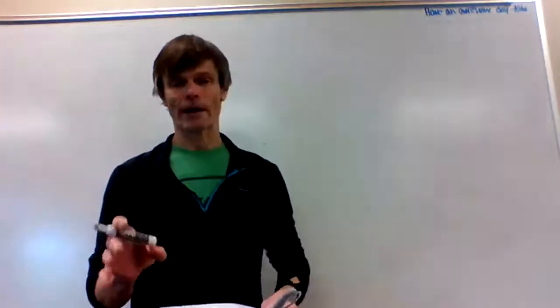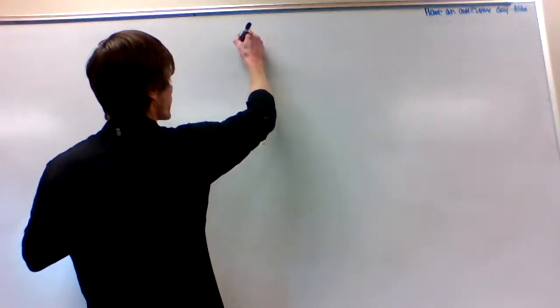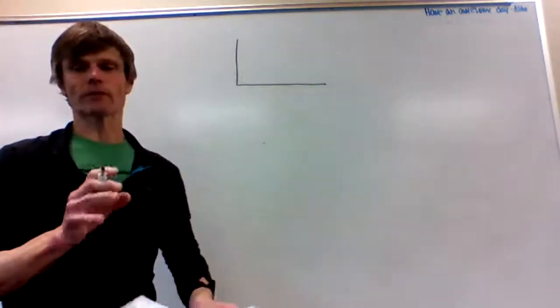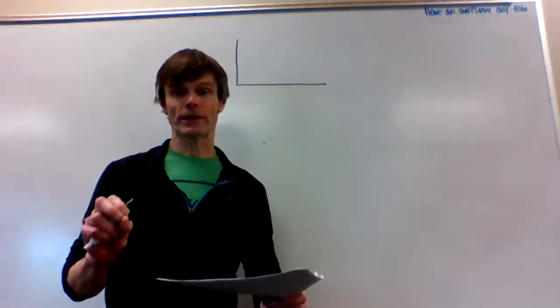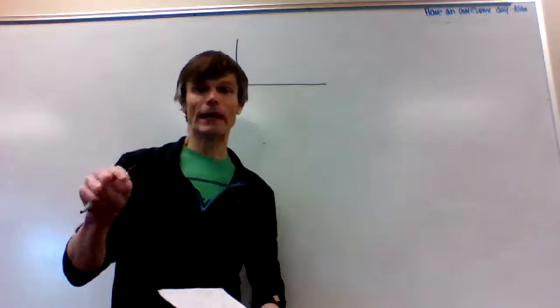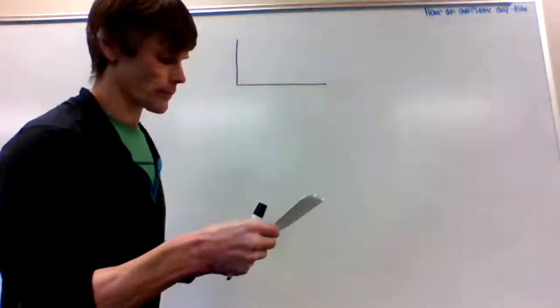So here are my notes. I'm going to go over these, and I'm going to look at two chromatograms: one that has good resolution and one that has bad resolution. Again, I am not the best artist, but I'll do my best. We have a chromatogram, and what we're using in these chromatograms is UV-vis absorbance as a detector to tell us something about how much of each component is in these different samples, because peak area is related to concentration, as we're going to show a little later when we get into quantitative applications of chromatography.